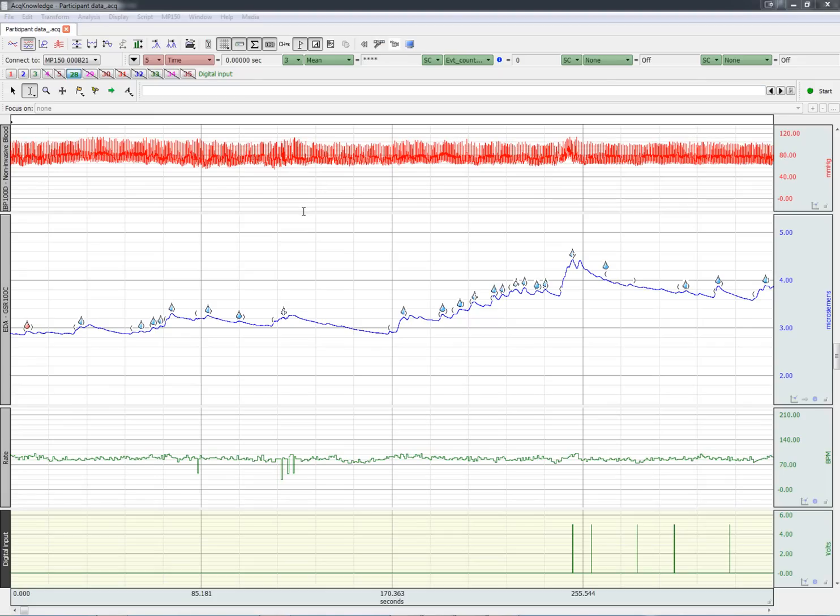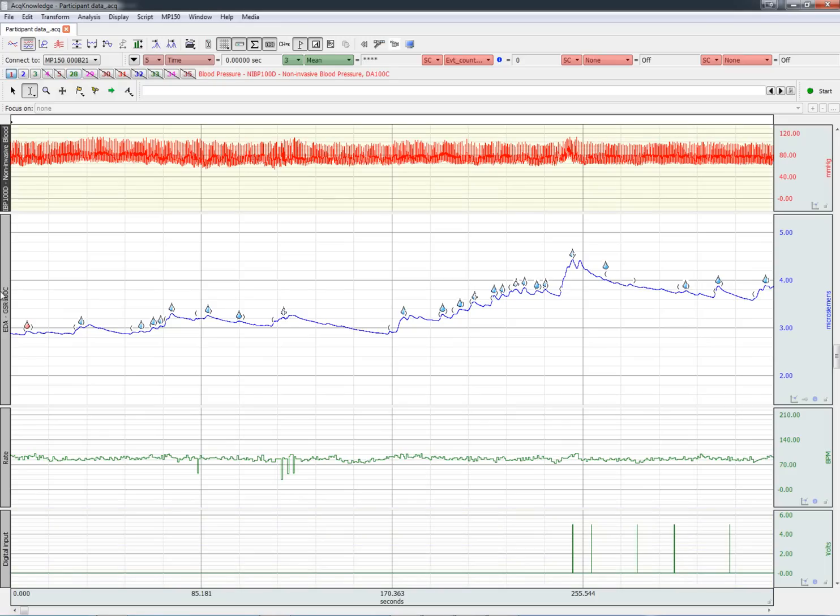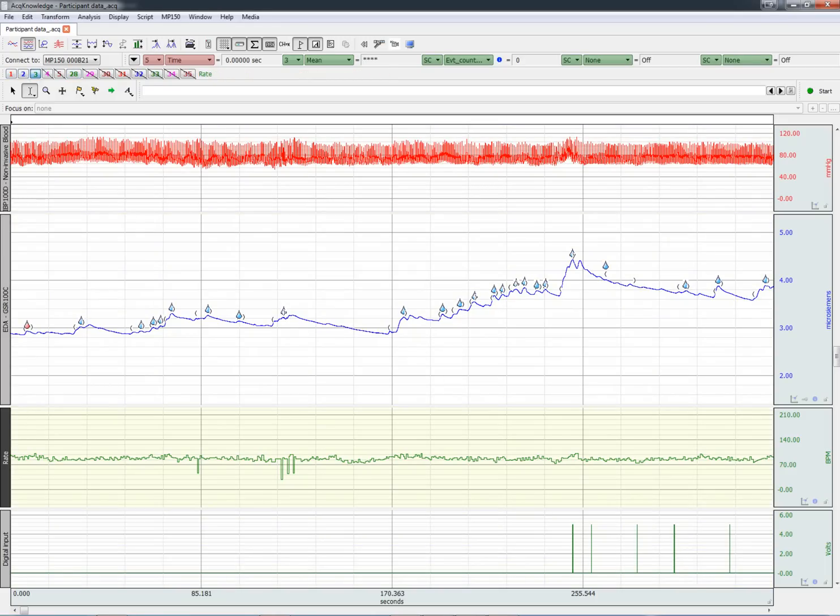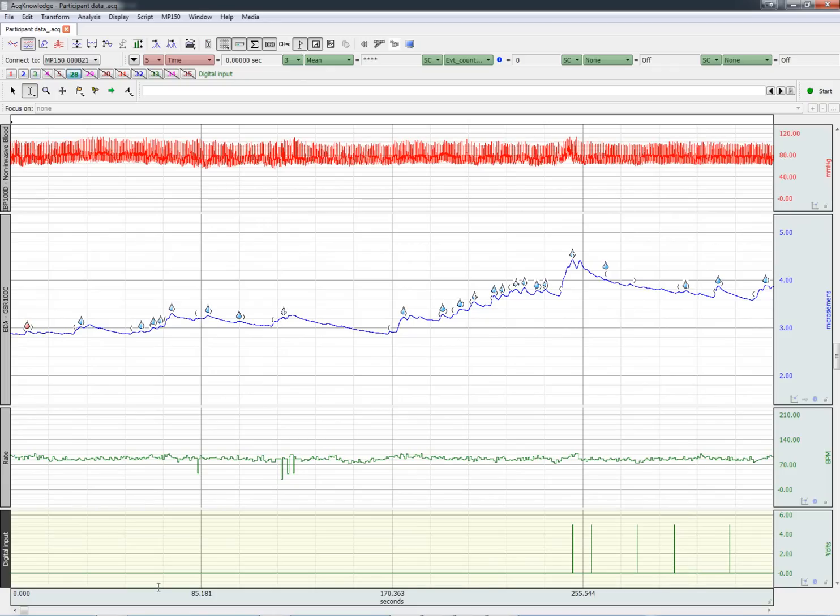First of all, here is some physiological data that was recorded with Biopac's equipment. We have blood pressure, skin conductance, and heart rate. A digital input channel has recorded the trigger from SMI that came over the paleo port at the beginning of the experiment. It's the one right here.